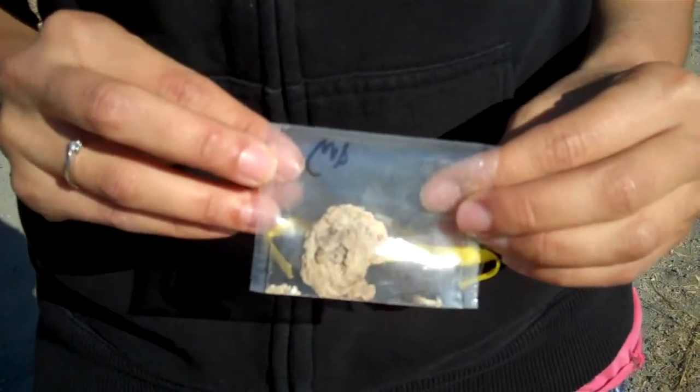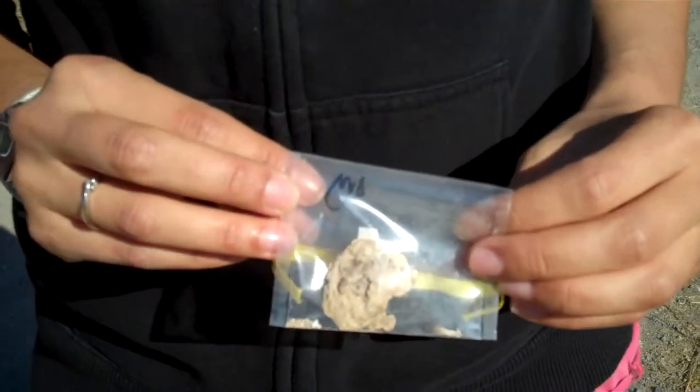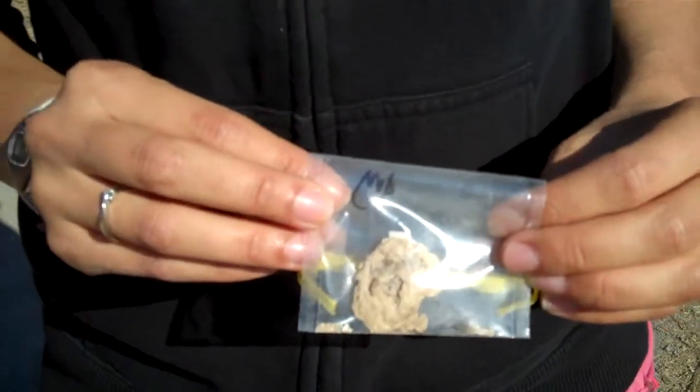This is a Brant's Cormorant pellet, which is the regurgitation of indigestible materials. We collect these in order to see what the birds are eating, and now we're going to take you into the lab to show you exactly how we analyze these.